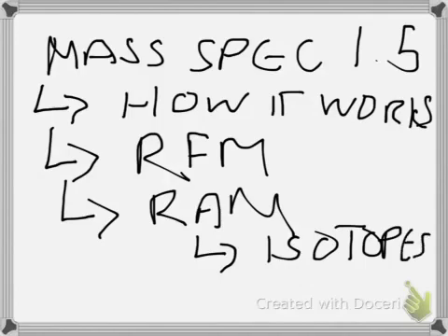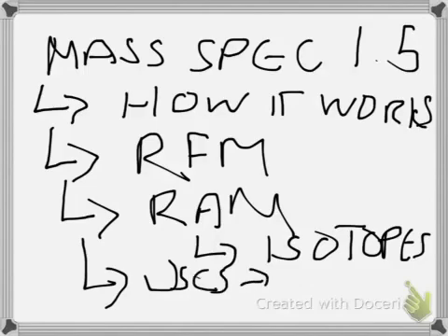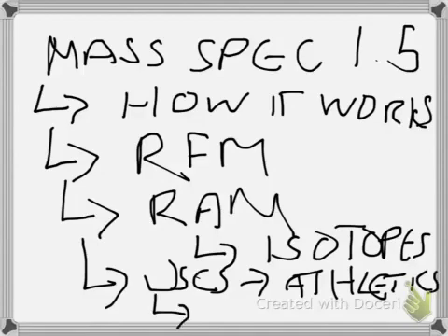Okay, and then looking at how mass spec can be used both in athletics, in the identification of banned steroids, but also in pharmacy and pharmaceuticals, in the identification of drug precursors.